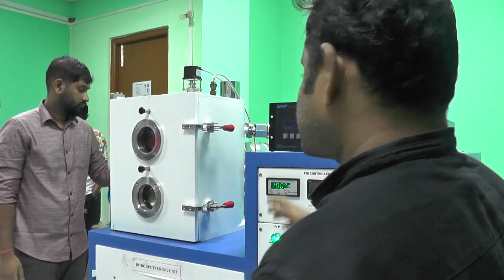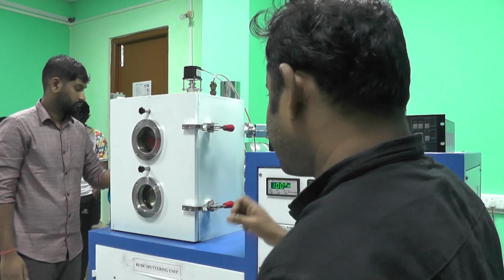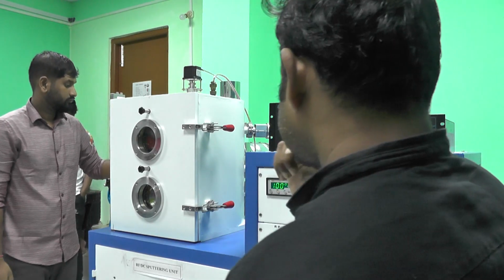We need all those parameters, then we move forward for deposition.